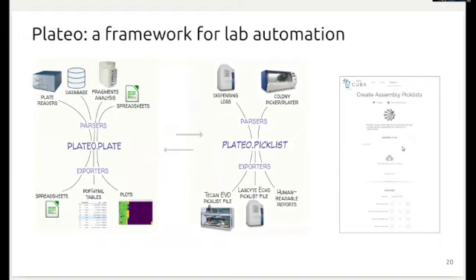This has been mentioned before. PLATO is a module that is now part of BioPython, so I'm just going to mention here that we use that to produce the whole plan that can actually be used on the platform, and also a nice report on what's going to happen once the assembly is actually performed on the platform.